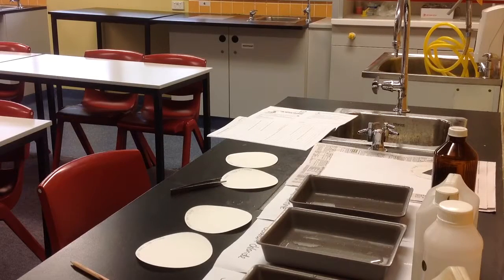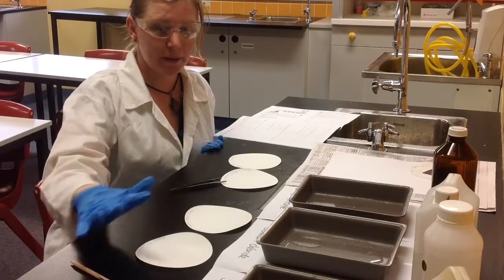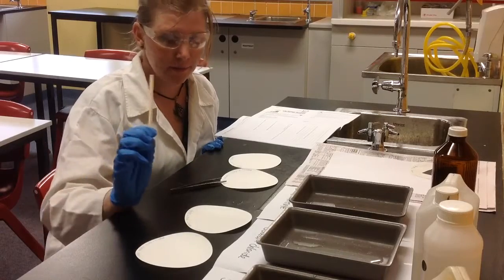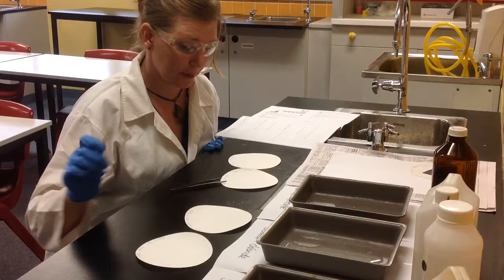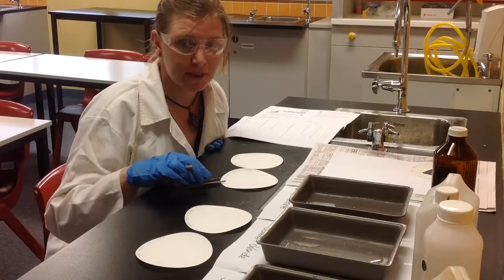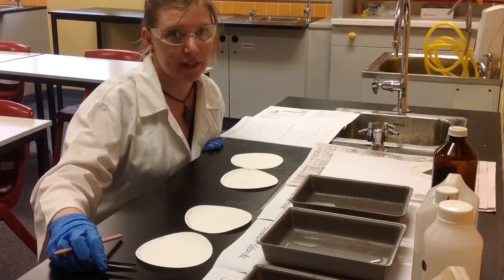This is how we conduct the experiment. Starting off, we have four pieces of filter paper. On each of them, I've used a pencil and written down what chemicals I'm going to apply to it. I've also written my name and the date, because if you're going to do an experiment that may take more than a period, you always need to label what you're leaving in the lab.